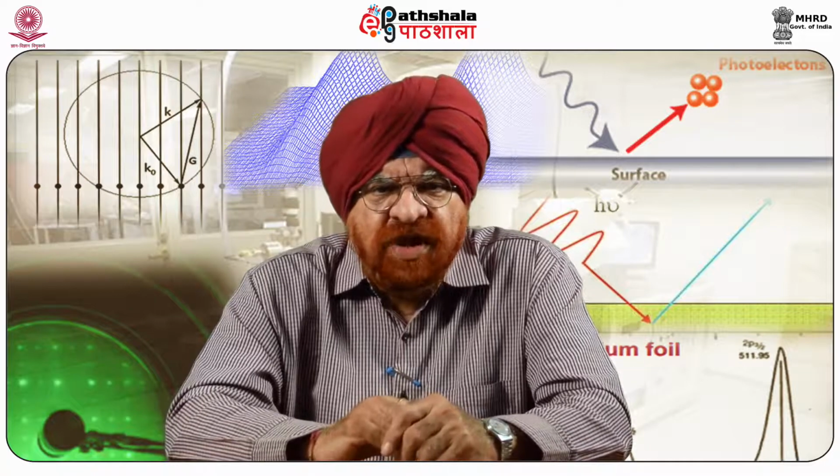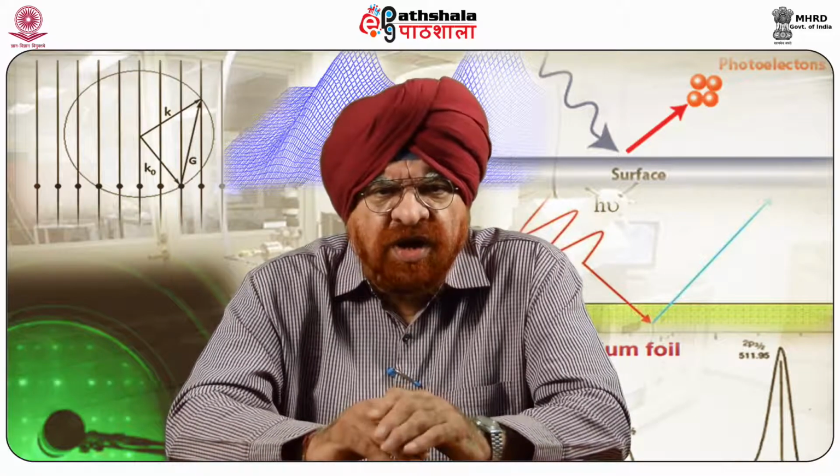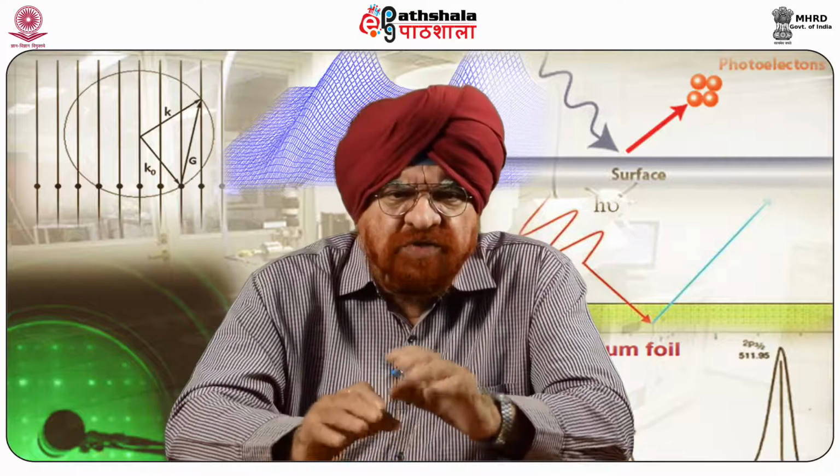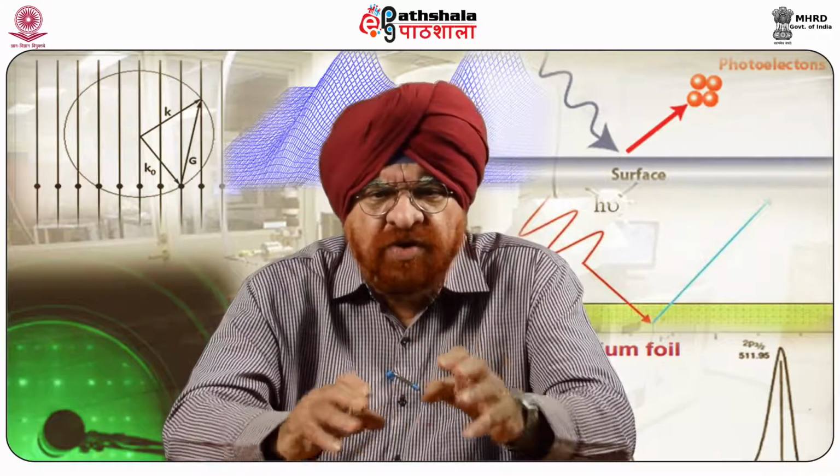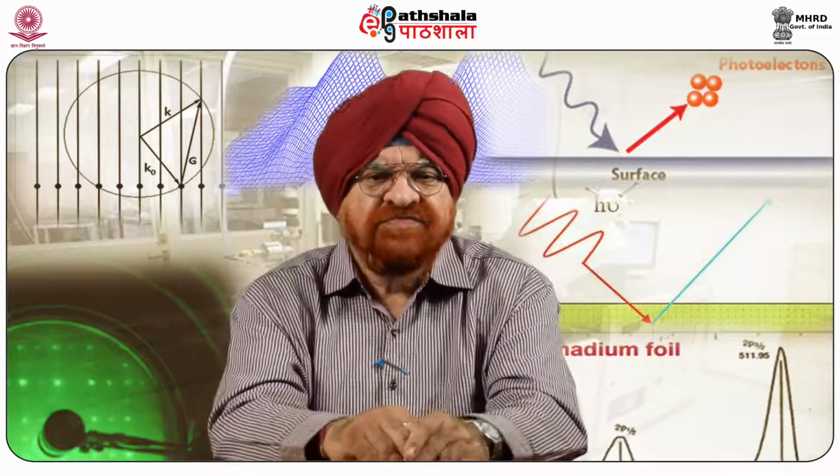Unfortunately, biological samples can be challenging to study in contact mode because they are generally soft, weakly bound to the surface, and damaged easily. Efforts to image biological samples drove the development of non-contact mode in 1987.